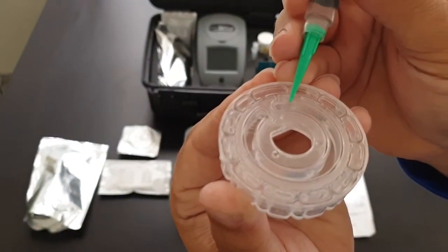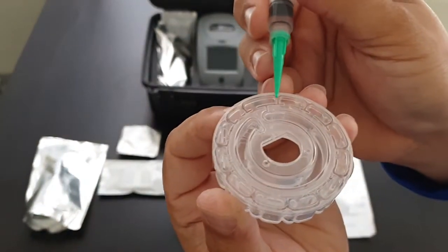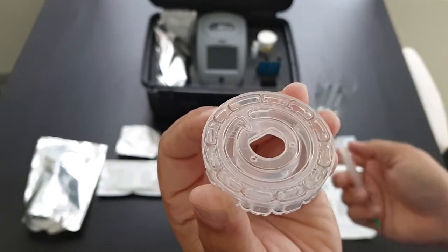There's the fill line — you can go a little bit over or a little bit under. There's an overflow chamber here, so if you go a bit over that's okay.